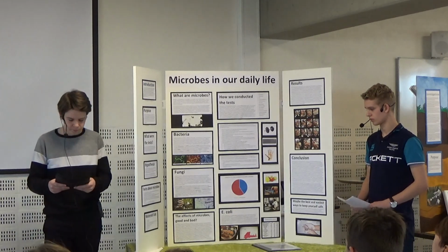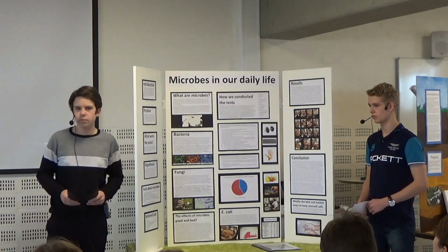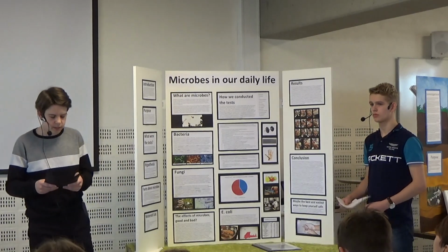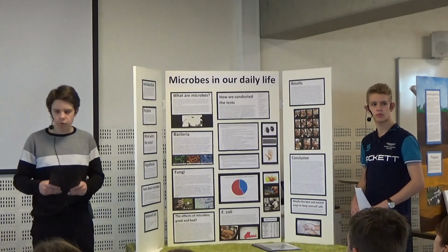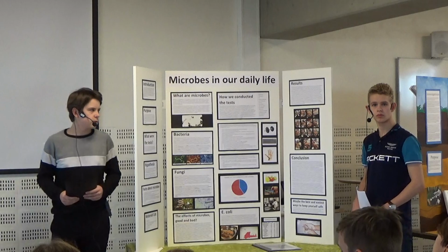and school fruits. When we had taken the samples of the different places, we put the agar plates in the heat incubation chamber from Friday to Tuesday. Tuesday we brought them out and started preparing our slides.